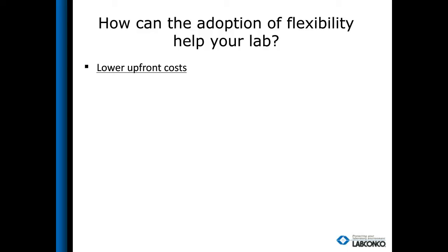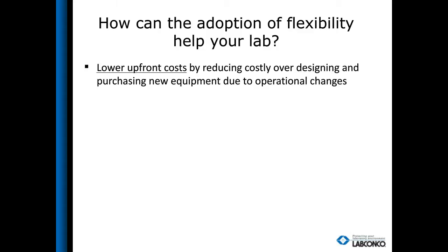So there are 4 main points you can get out of this, and again, this applies not just to biosafety cabinets, but to fume hoods, water systems, et cetera, that you need to look at when you're designing laboratories and giving guidance to the design team for selecting equipment, whether it is owner furnished, where after you take possession of your lab you're the one buying it, or sourced up front by the contractor or the lab designer. The first is lowering upfront costs, and that's done by selecting for flexibility so that the architect, the lab designer, does not over-design your facility.